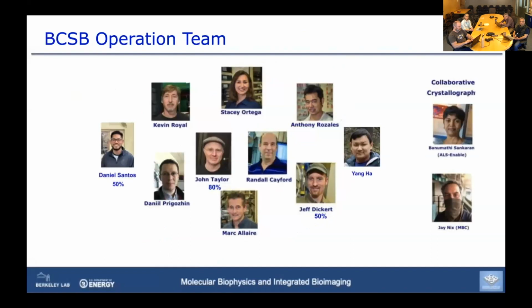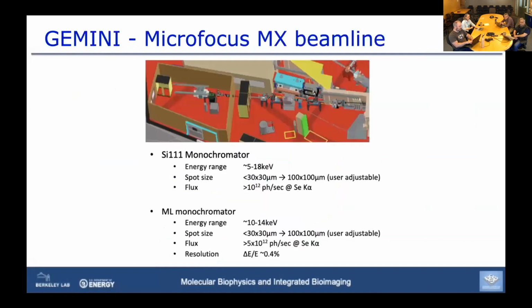I think we have a lot of people on this webinar, but there are a lot of people behind the scenes who keep the beamline operating. And I just want to be sure that you see their faces when you start using our beamlines. So we were talking about the latest beamline on the floor, Gemini, beamline 201. Basically, that's the first micro-focus MX beamline at the ALS. It uses a silicon 111 monochromator, and or a multi-layer as well. The focus size can be as small as 30 by 30 micron. Indeed, we've been achieving better than 20 by 20 micron this time.